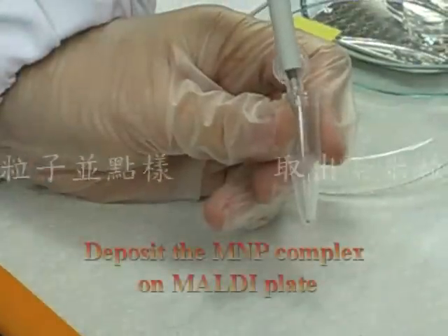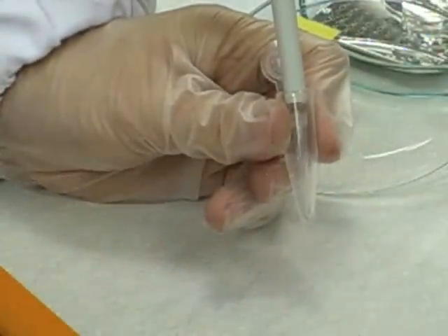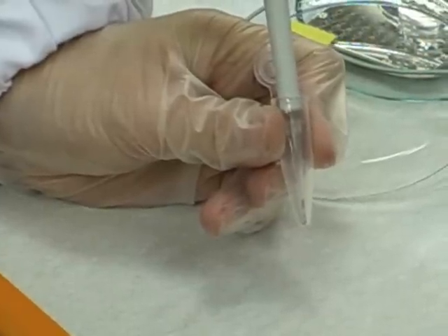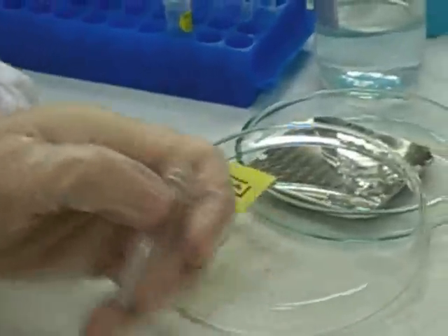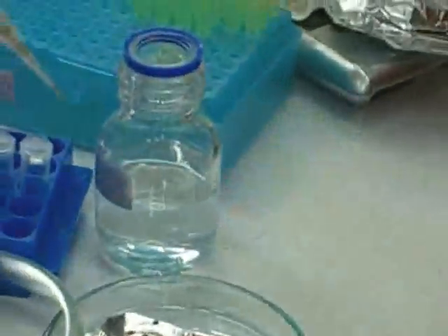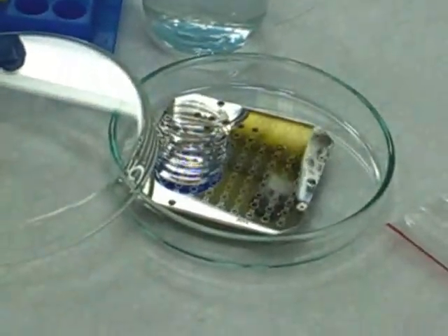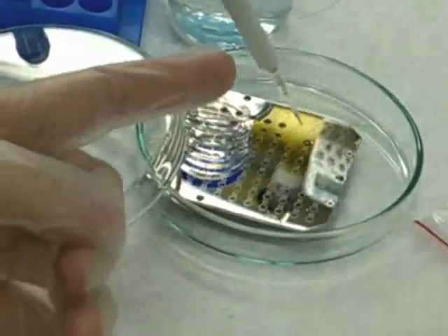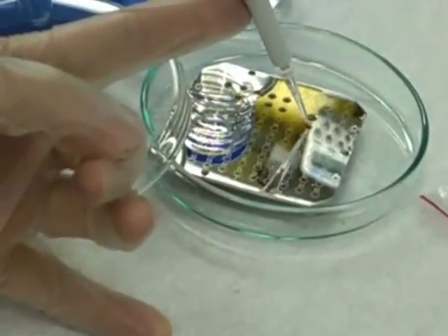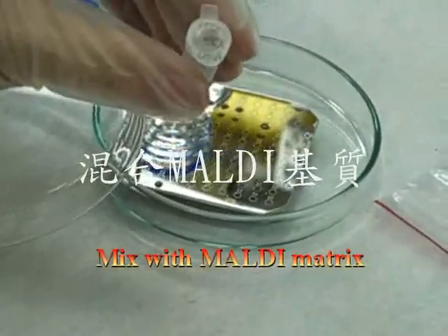Then, the magnetic nanoparticle complexes are directly deposited on the MALDI plate and dried in air. In the video, we carefully deposit the magnetic nanoparticle complex on the MALDI plate, then mix with the MALDI matrix.